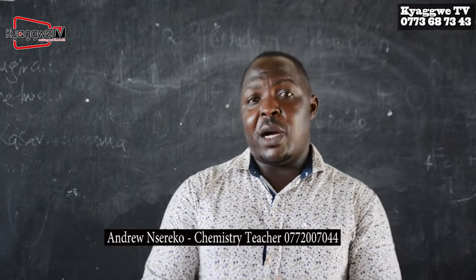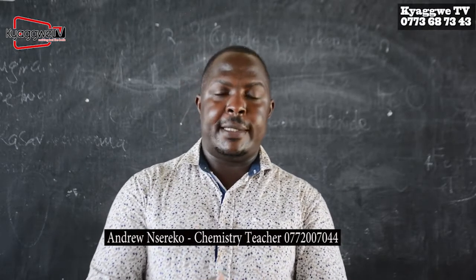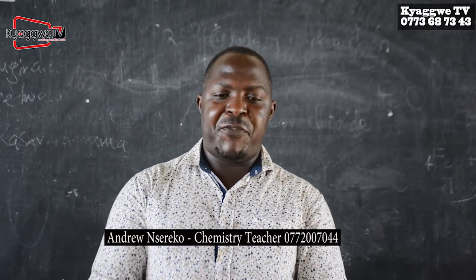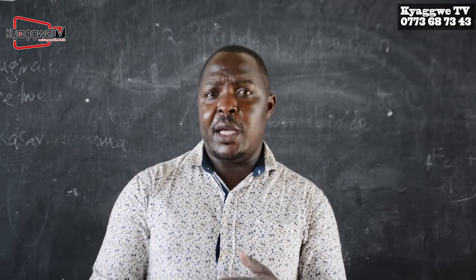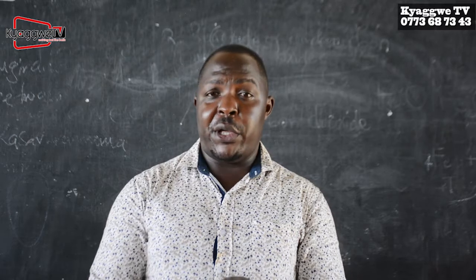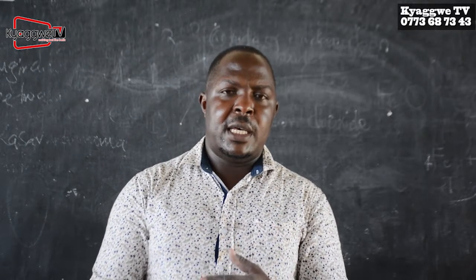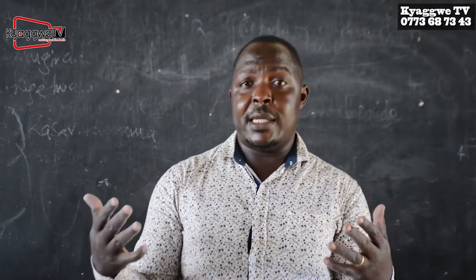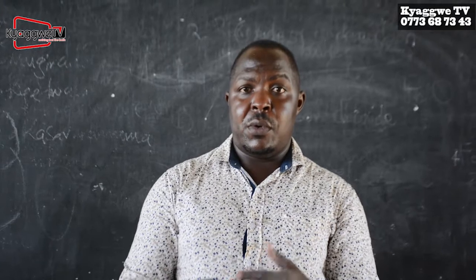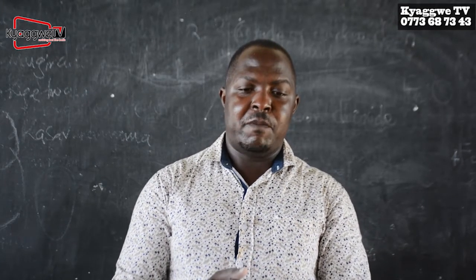This is Nsereko and Huntington, your chemistry teacher today, and we're looking at the physical properties of carbon dioxide. We had said today we would look at the uses of carbon dioxide. However, we find it very necessary that we see the properties first so we can understand the uses. We're looking at the properties of carbon dioxide.